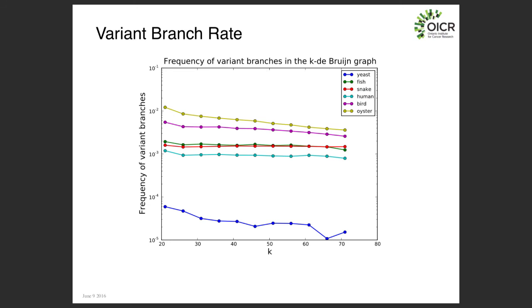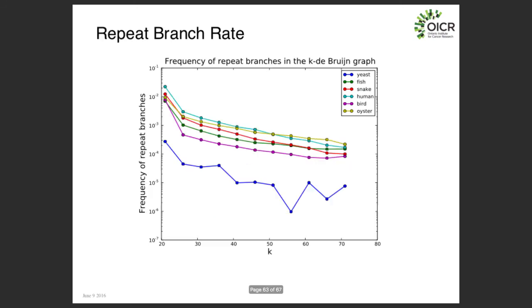So this immediately, if you ran this program and looked at this data set, and you see that heterozygosity is about 1 in 100 bases, this should put up a big red flag that it's going to be a very, very difficult genome to assemble. Conversely, if you have a human genome, you see 1 in 1,000 bases, that's not too bad. The assemblers are pretty good at assembling genomes that are that heterozygous.